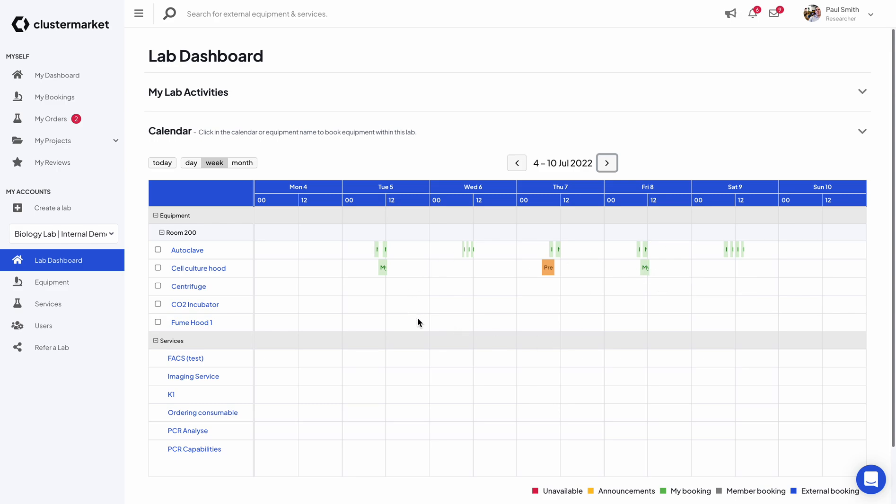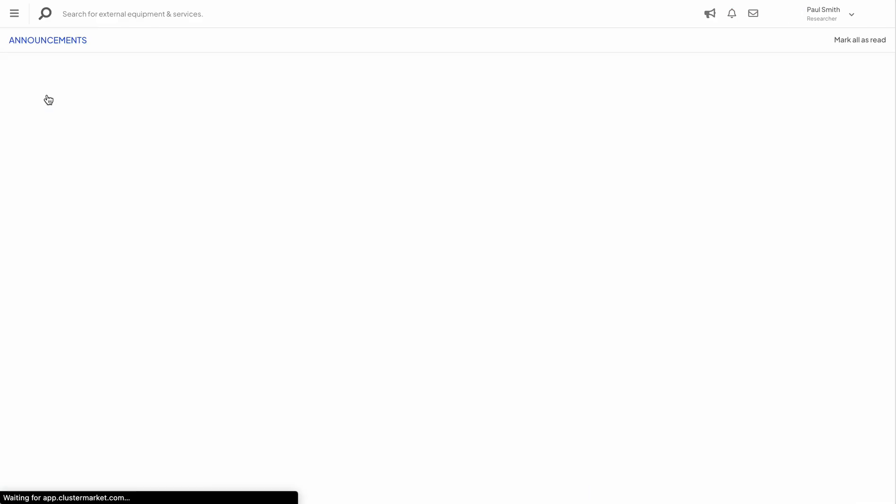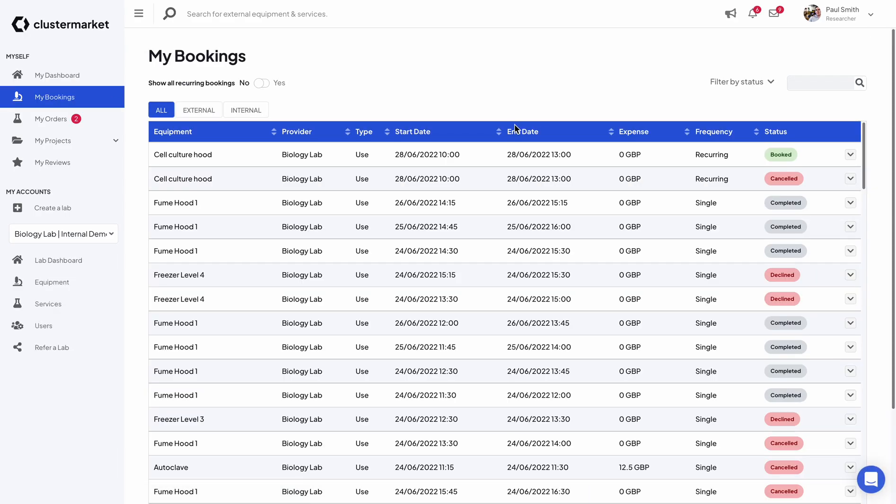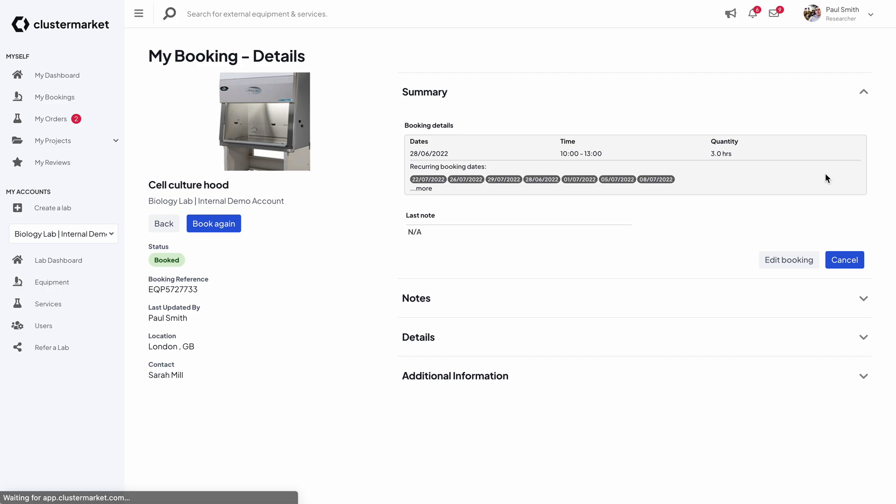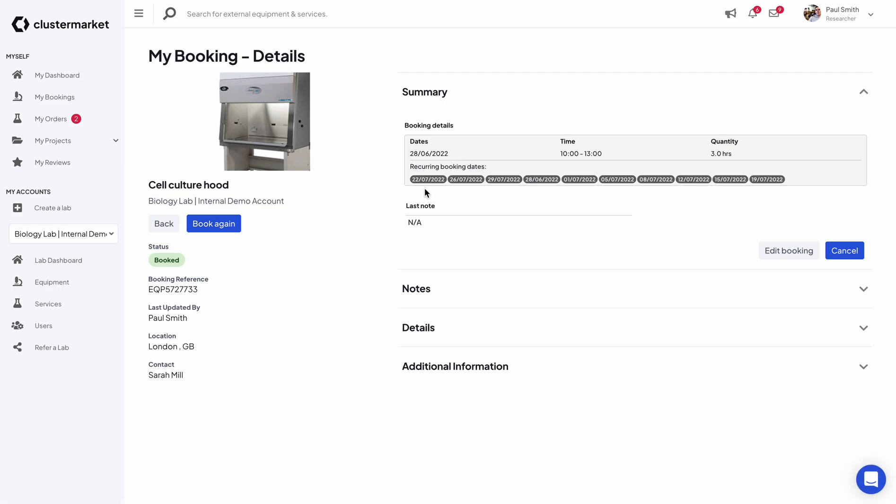An easier way to just see all the bookings you just made is by going to my bookings and just check the last one you made. It will say recurring and then you can click on details to actually check all the dates that you booked for. So you see all the 10 dates, all the Tuesdays and all the Fridays that you have made a booking for.